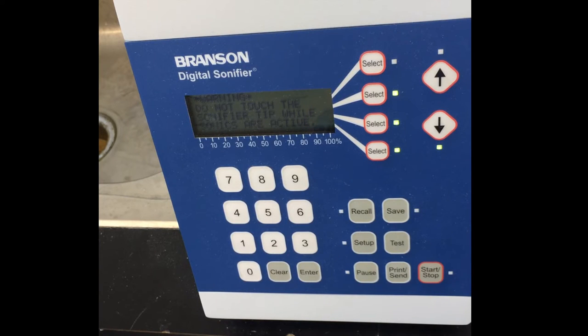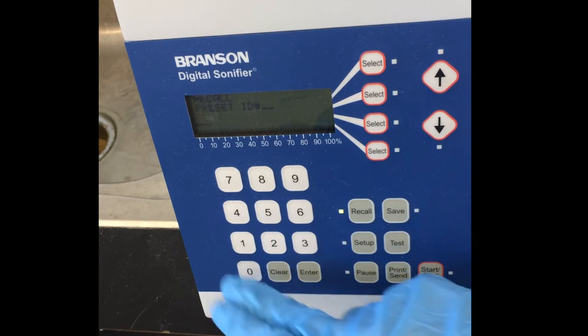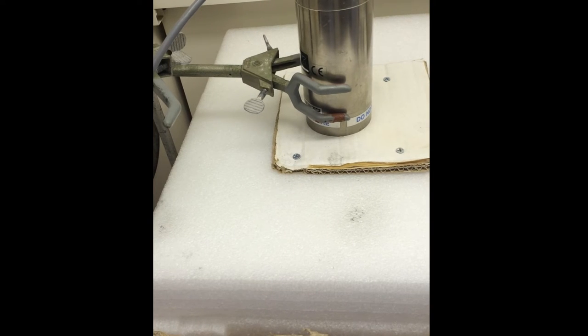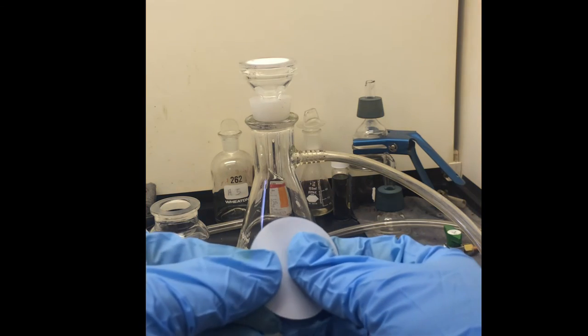The mixing bottle is placed in an insulated and cooled environment in order to reduce noise and reduce risk of overheating the mixture. Once the sonication settings and placement is set, the sonicator is lowered into the mixing bottle and the process has begun.